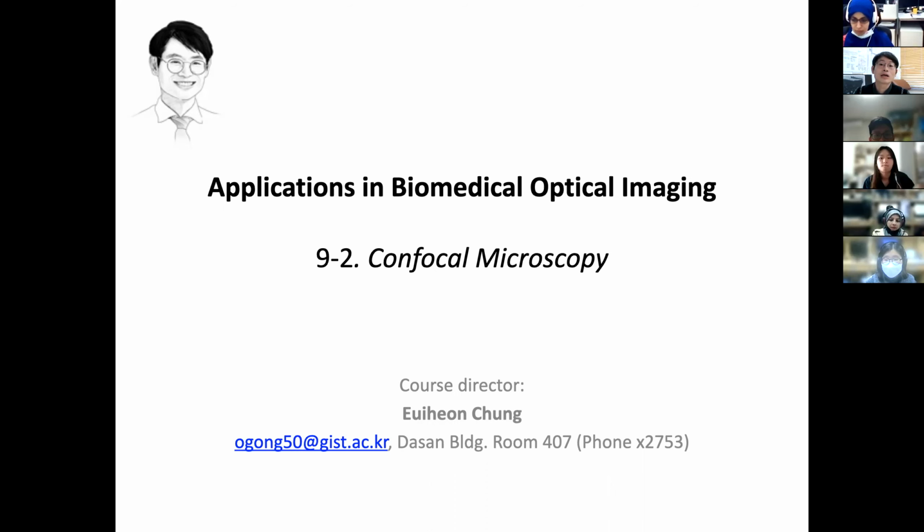For covering confocal microscopy. This is a fabulous technique. It can be an innovation in microscopy history. So I think it's a really important topic. Those who are either developing microscopy or using microscopy, especially for advanced laboratories, many of the biological experiments use this confocal. Why? Laxman, have you ever used a confocal microscope?